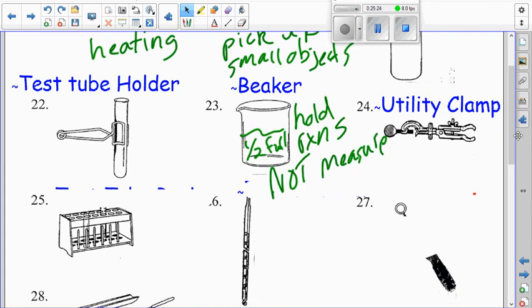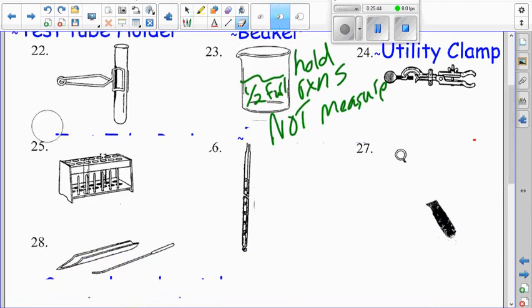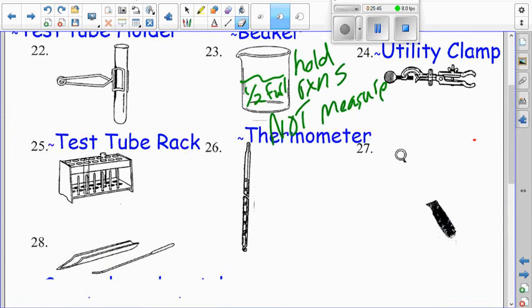A utility clamp, that's just used to hold things for heating. So, here's what a utility clamp looks like. Boom. You can use it to grab test tubes around like that. So let's say I want to heat up a test tube, you can use it like that, that kind of thing. So it holds round objects. Test tube rack holds test tubes. It's wooden. It's right there in front of my desk. This guy's a thermometer, and you should always be in degrees Celsius in this class. Always degrees Celsius in this class.